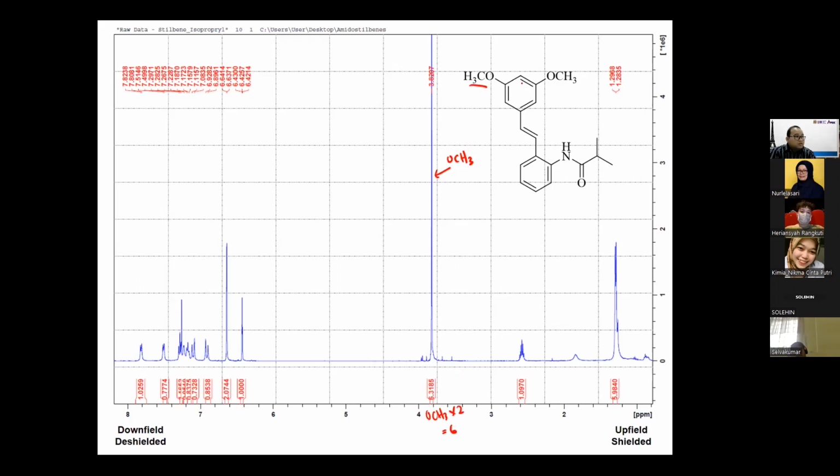So the second set of hydrogens becomes 6 hydrogens, which is in these regions. As I said, this one in these positions is multiplets, this one is singlet, and this one, if you see clearly, is a doublet. Because they are in symmetrical form, it shows only one signal. But you can see the integration here is 6.